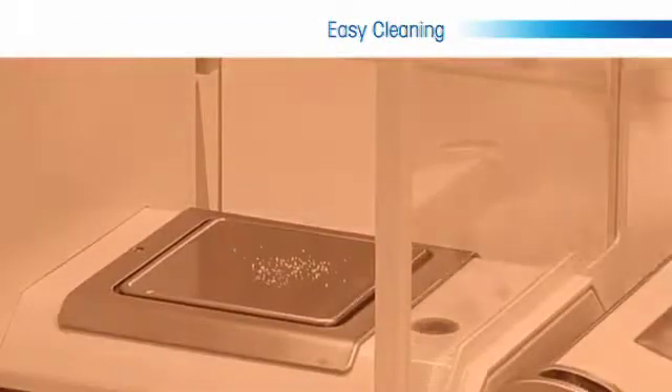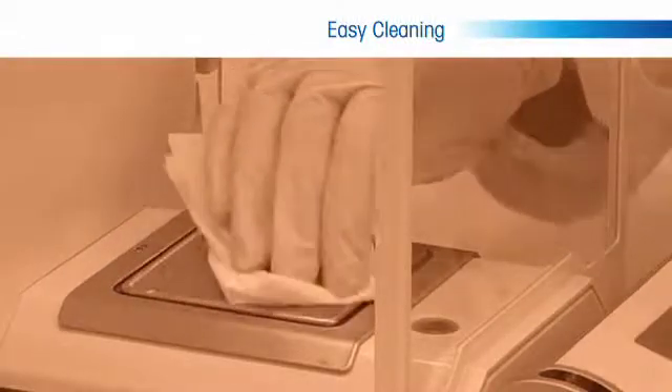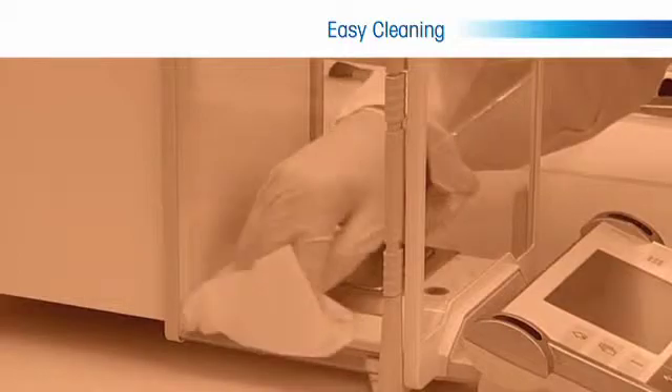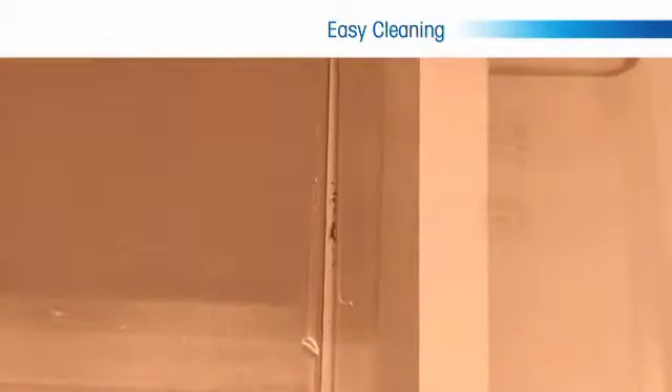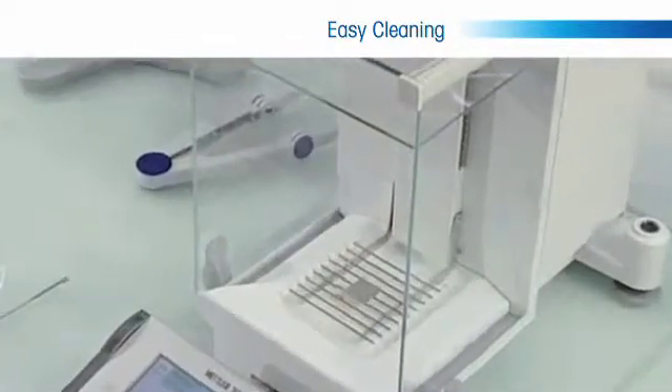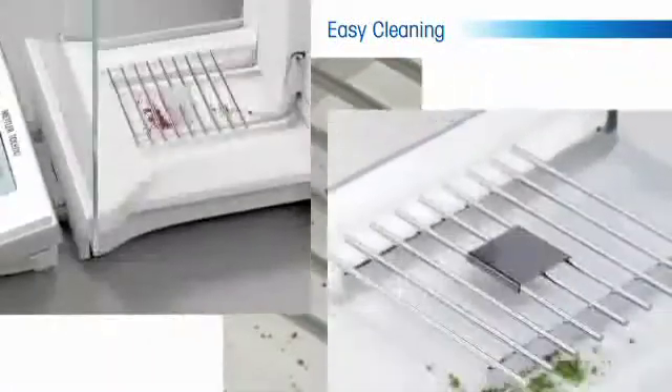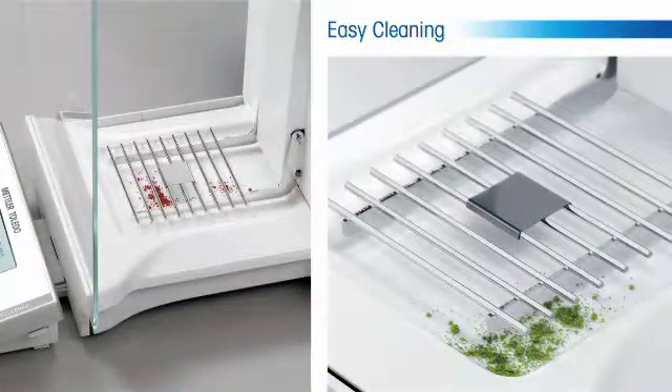One of the many challenges balance users face in weighing is cleaning of the balance. This can be an issue during the weighing process when a substance is spilled on the weigh pan and must be cleaned to avoid affecting the weighing result. The gridded weigh pan allows any mishandled powders or liquids to fall through the weigh pan and be easily collected in the chamber catch tray.